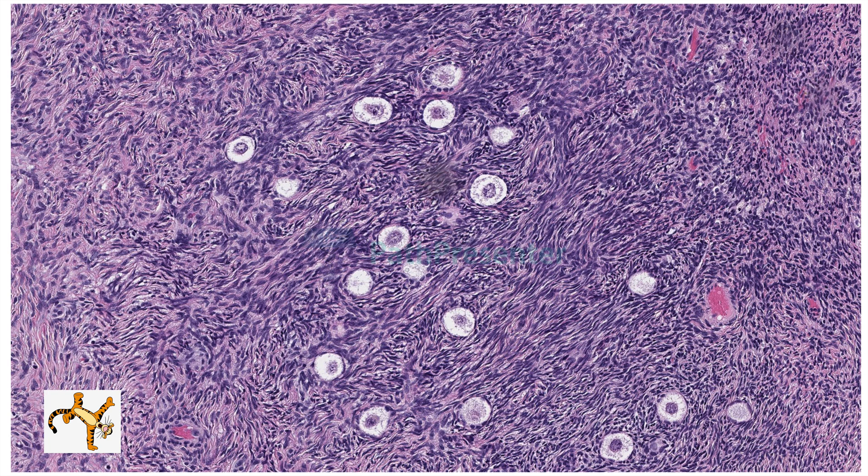These are primary follicles, which appear at the third month of fetal development. This is also an excellent picture to point out ovarian type stroma, which is composed of spindled cells showing a storiform or cartwheel pattern — I put a picture of Tigger doing a cartwheel so you'll remember what that means.